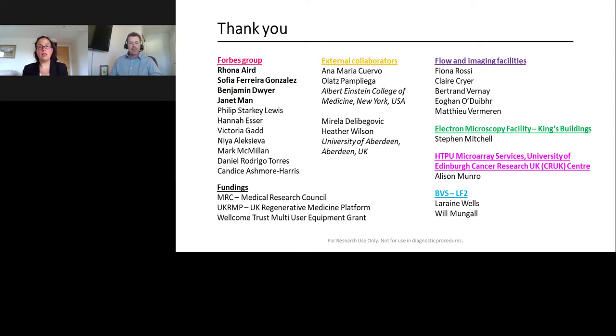With an antibody against phospho-STAT3, particularly against the tyrosine in position 705, which is the phosphorylation we are particularly interested in in this context. And it's commercially sold by BioLegend, so we just buy it off the shelf, really. And then we perform our cell surface staining for CD11B as a general myeloid marker, which is by no means specific for macrophages, but because we are using bone marrow-derived macrophages, it is only macrophages that are in our cell culture. We've previously shown that our cell culture is 99.8% macrophage pure, so we use CD11B quite confidently.